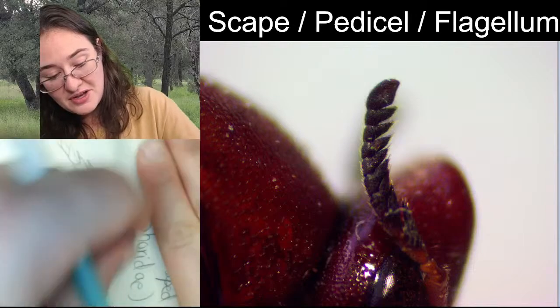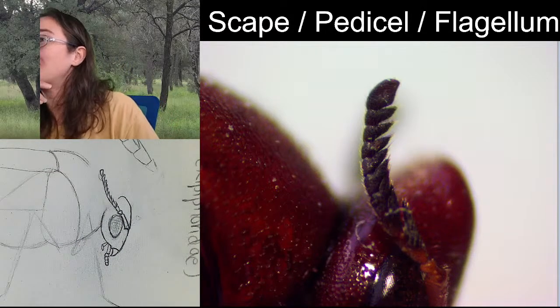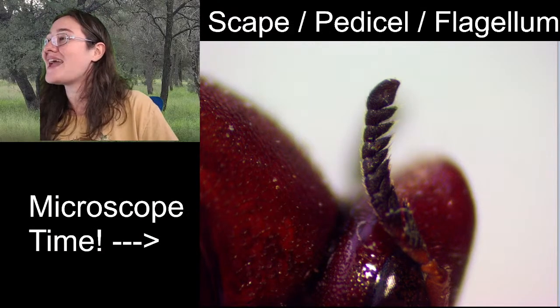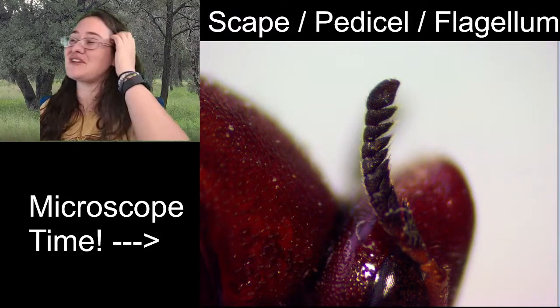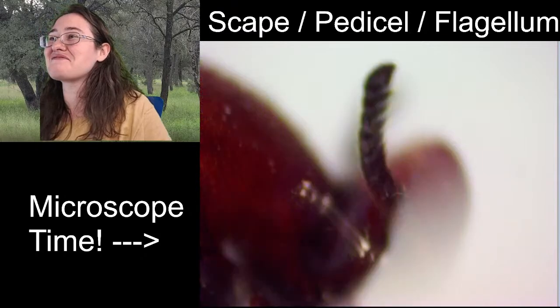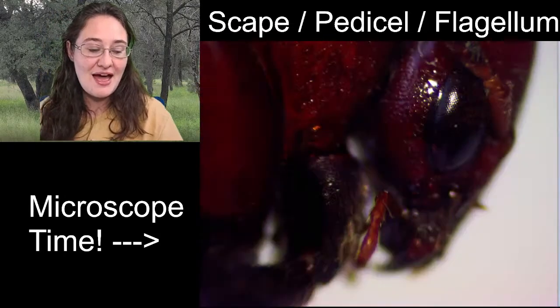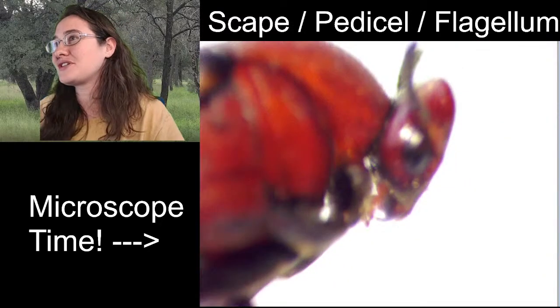Alrighty, so I'm gonna go ahead and erase some of that. We're gonna move on. They look like shark teeth. That's fun. Yeah, so that last antennal segment is a very different shape. Fair enough. Alright, so that is the eye, the antenna, the mouth parts. Very good. Let's scooch.